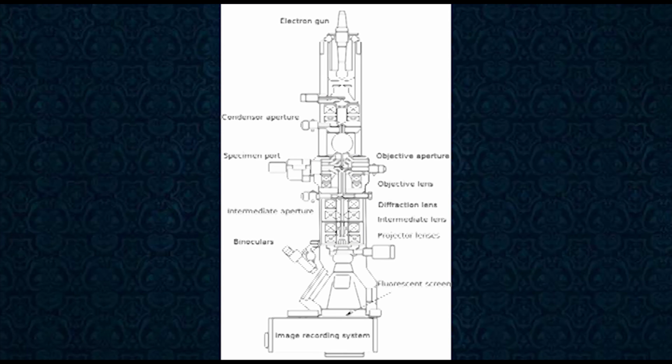In September of 1933, the first instance of exceeding the maximum magnification possible with light microscopy was achieved. Cotton fibers were briefly imaged by the apparatus before being destroyed by the electron beam. The microscope used, created by Ernst Ruska, was the first electron microscope with the ability to image specimens inserted into the device. Shown here is a diagram of the internal structure of a transmission electron microscope.